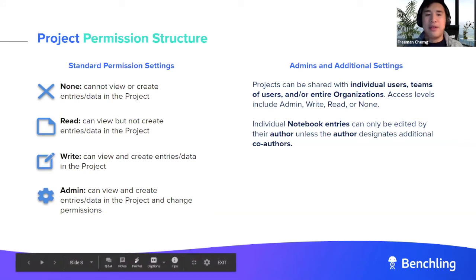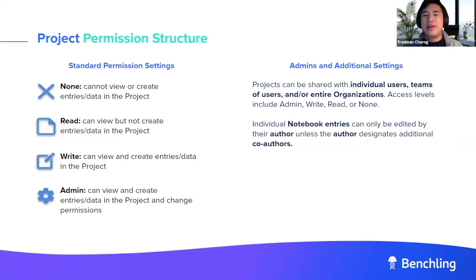So for example, if I have a microbial engineering team with me, Stefan, and Chin, you can assign write access to our team for a particular project. And me, Stefan, Chin, and whoever else is in the ME team will also have write access to that project.